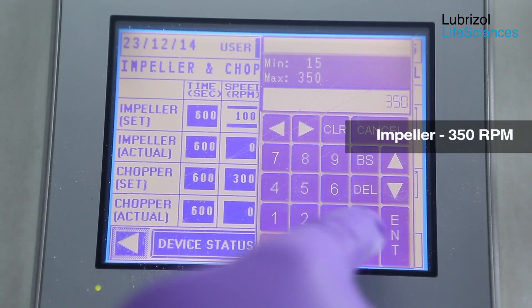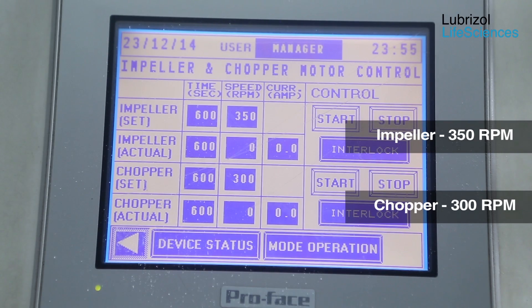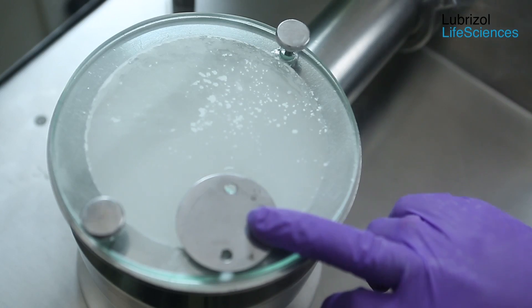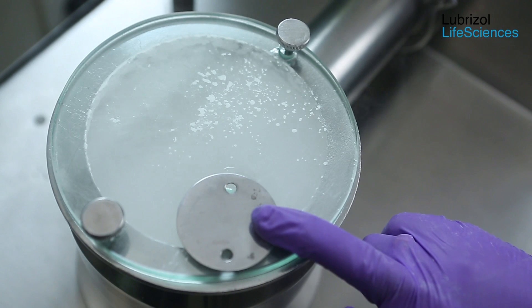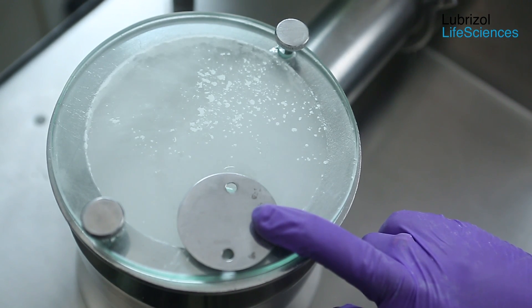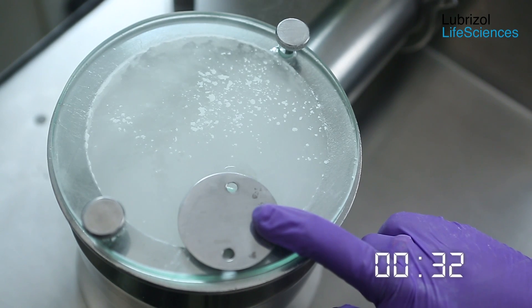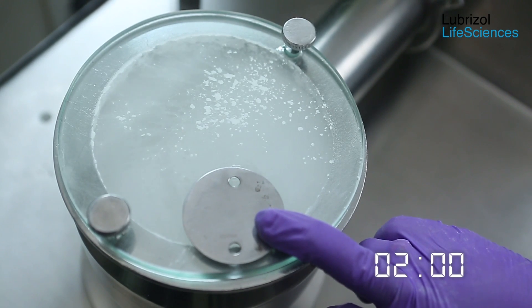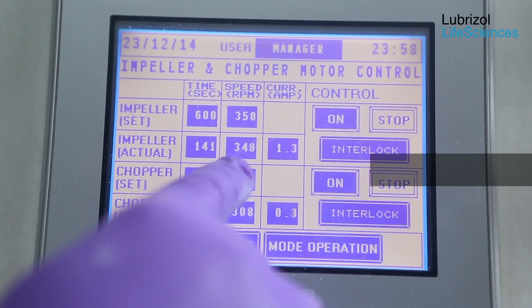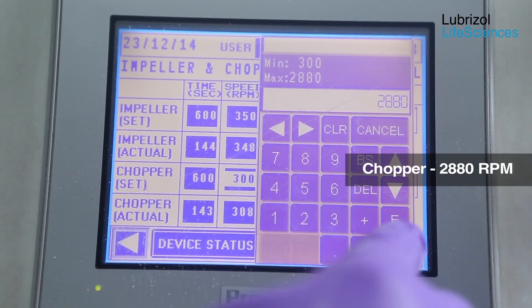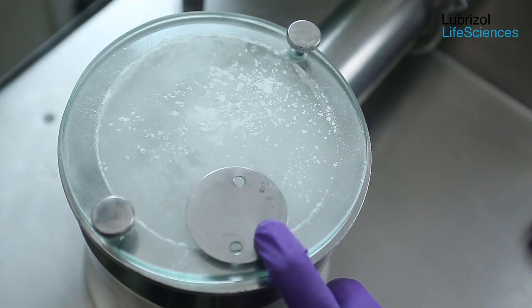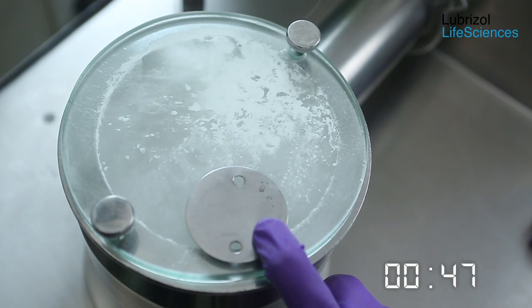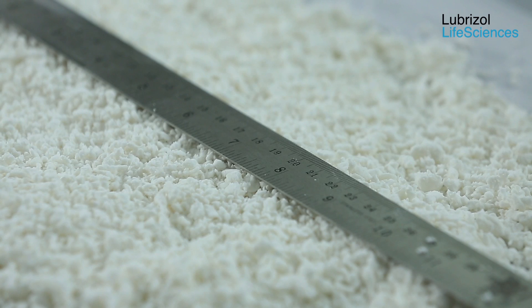The impeller speed is now increased to 350 rpm while the chopper speed is maintained at 300 rpm. 45g of water is added as a thin stream and mixing is continued. Note that during the first 1 to 1.5 minutes, the blend is looking dry. And now we can see that wet granules are forming. The chopper speed is further increased to 2880 rpm and mixing is continued for 1 minute to complete the wet granulation process.